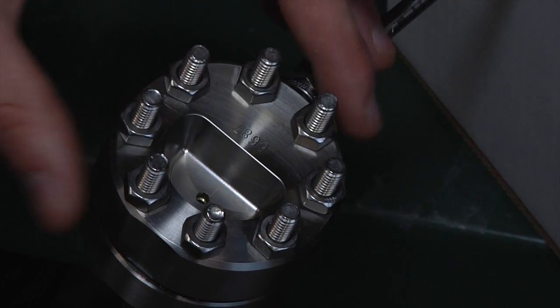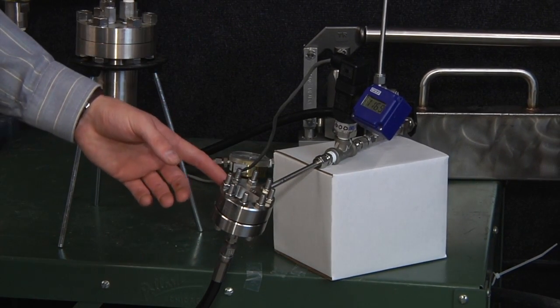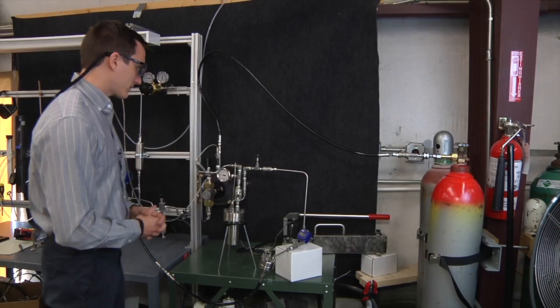From there, you can bolt up several different types of connections for outlet parameters like a flange, tube stub, etc. We have a couple different options, which I'll show you later.